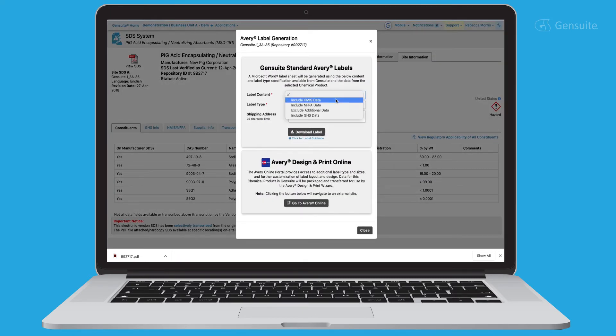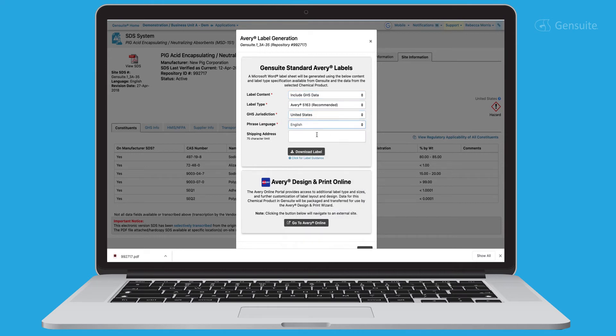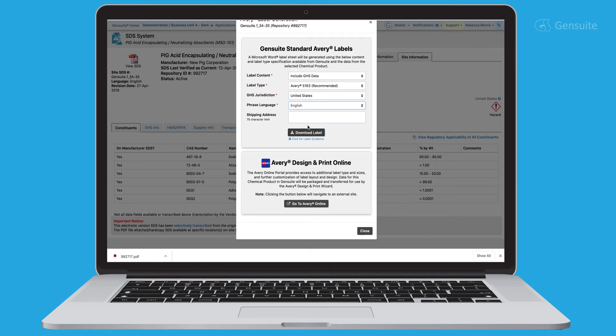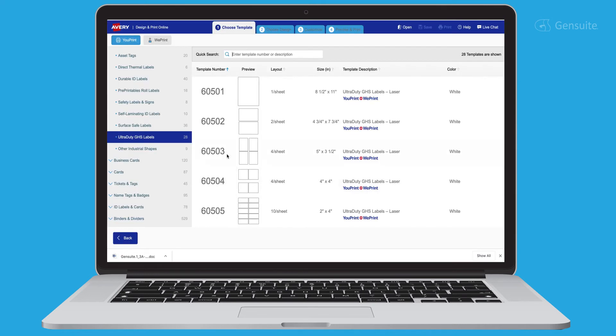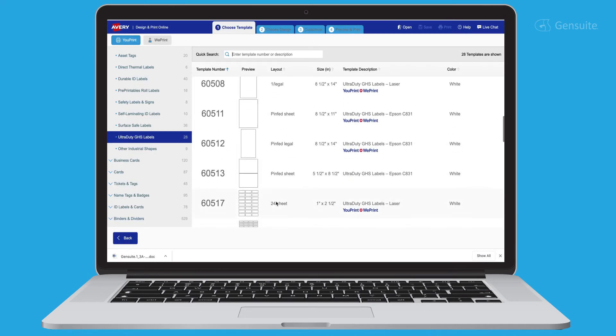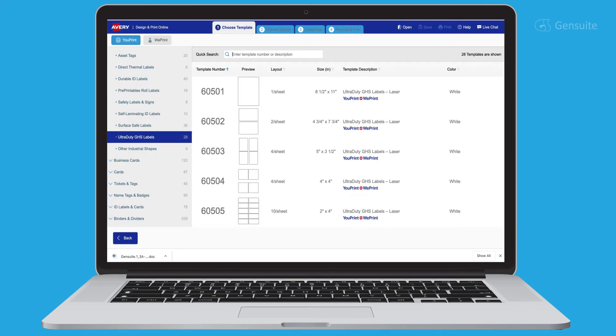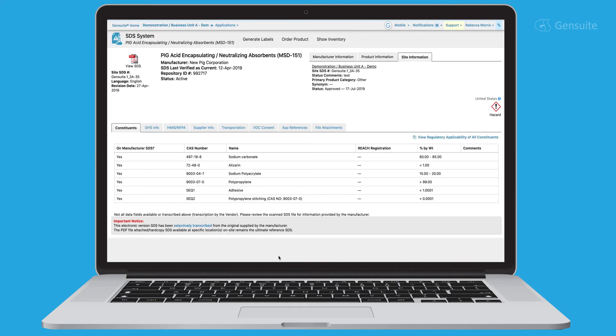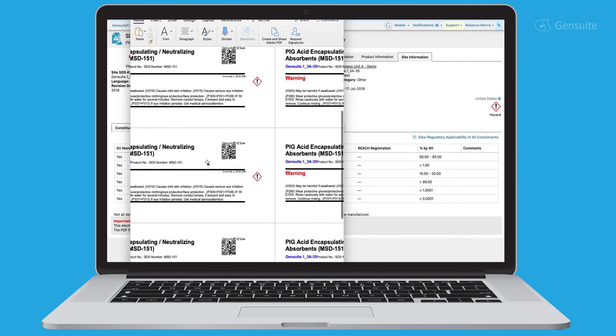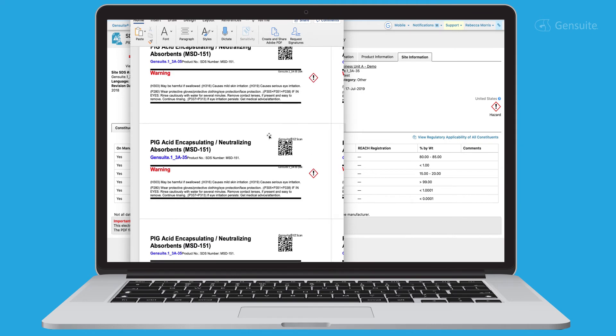Easily generate product labels directly from the SDS system. Print from the standard Avery template or check out the new integration with Avery online. Simply scan the QR code from your mobile device to view chemical details wherever you are.